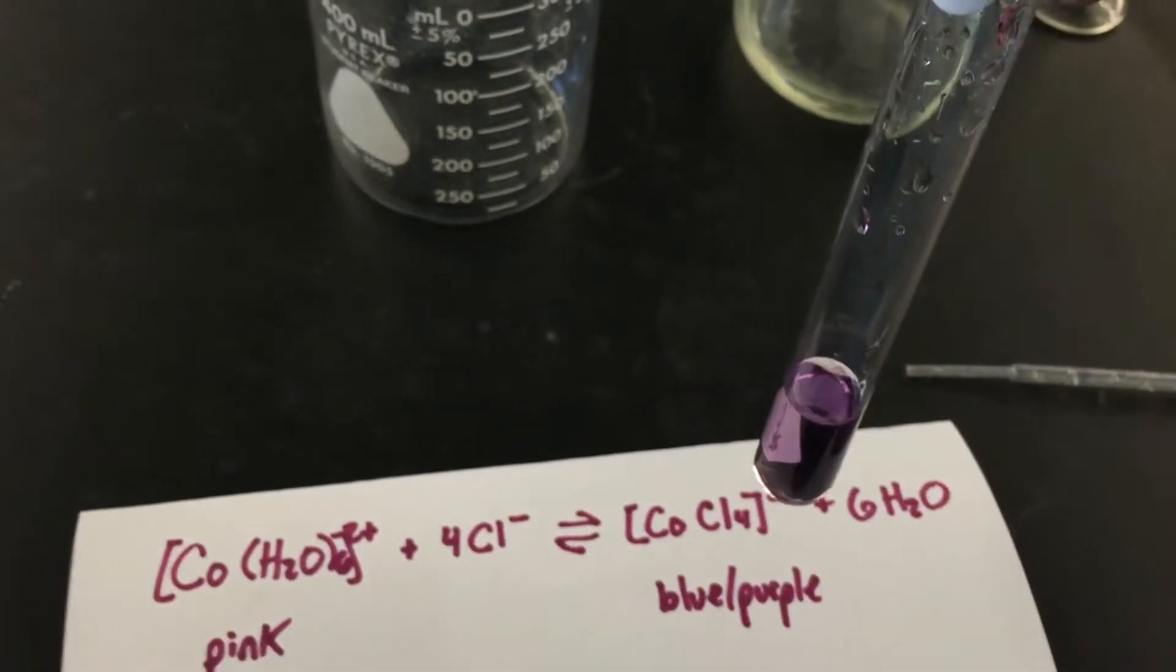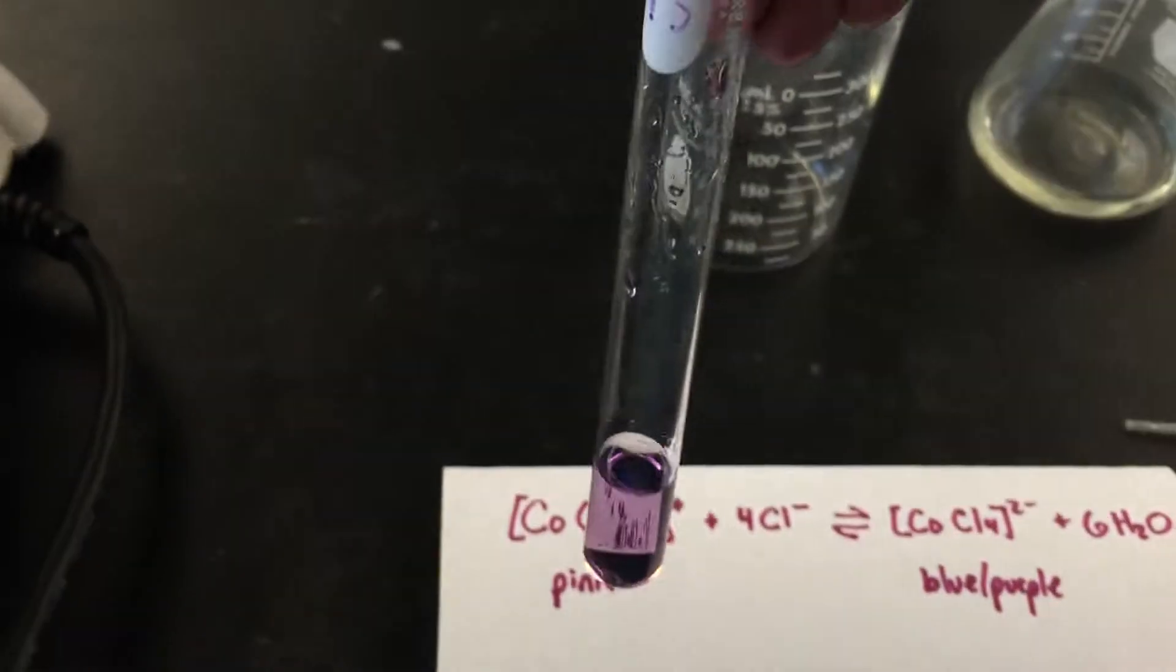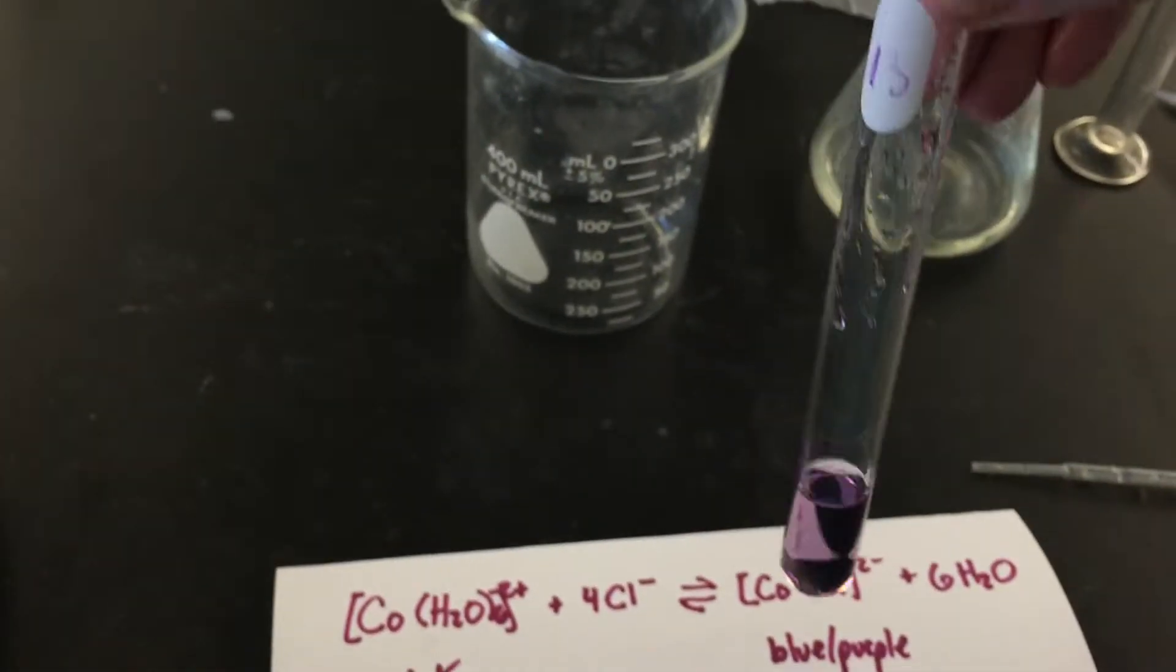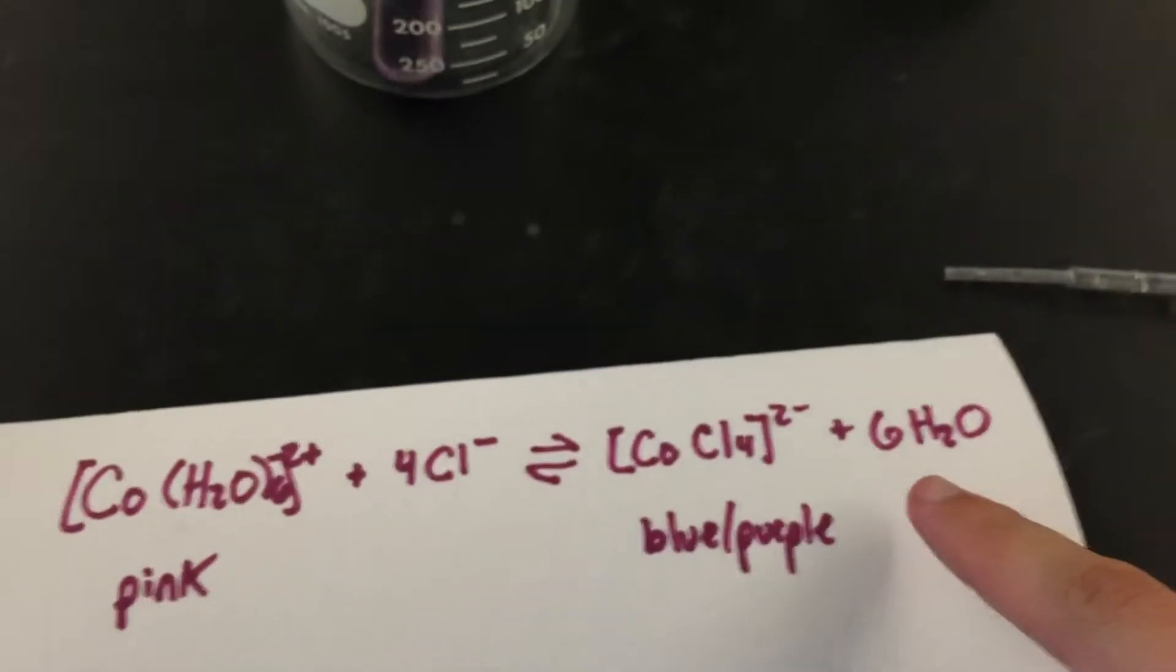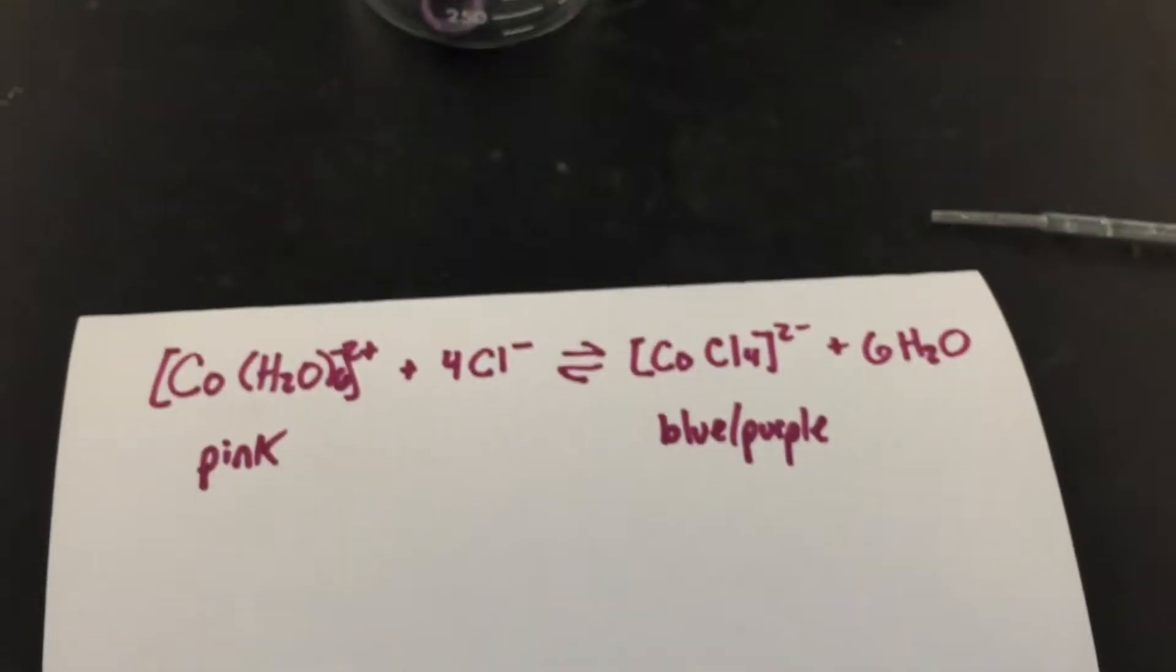The nice thing is, remember, this is a dynamic equilibrium. I can shift seamlessly from pink to purple or purple back to pink. How can I do that? According to my reaction, all I need to do is add some water.